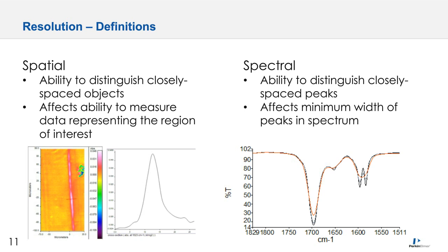It's important to note that when performing infrared measurements with these sorts of systems, if you go to the extreme of spatial resolution or spectral resolution, there's often some sort of compromise in terms of measurement quality or measurement time, because increasing the spectral resolution of the measurement will proportionally increase the measurement time, because the moving mirror in the FTIR will travel a proportionally longer distance.